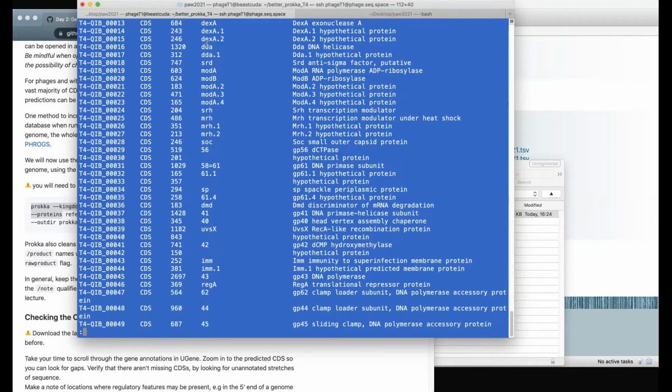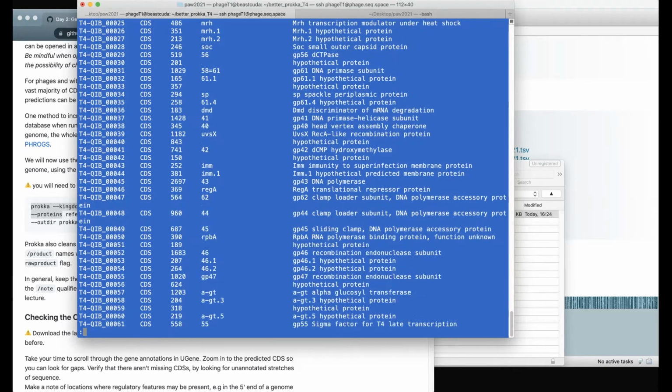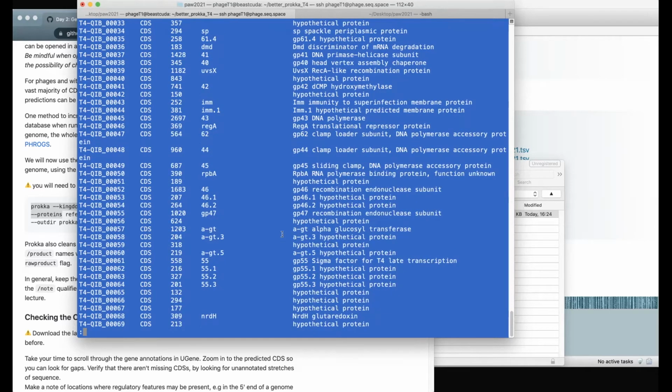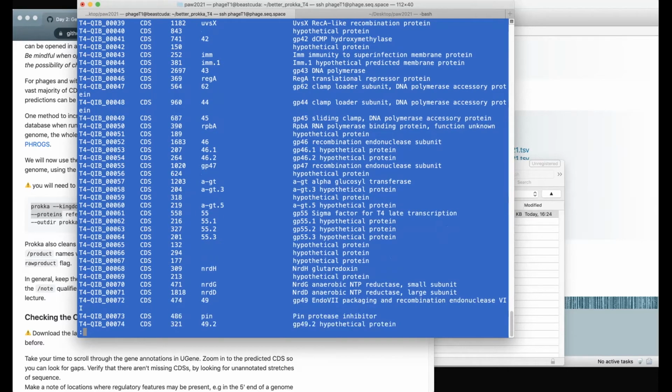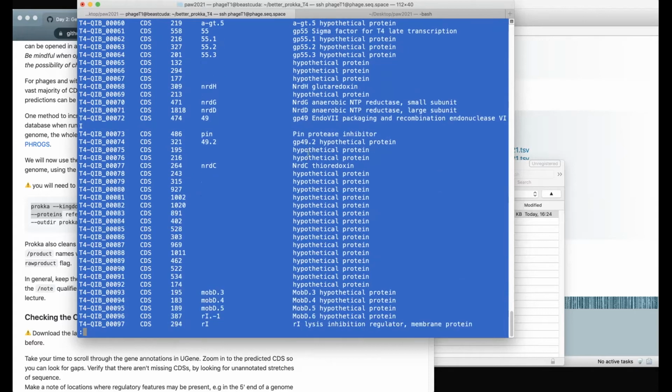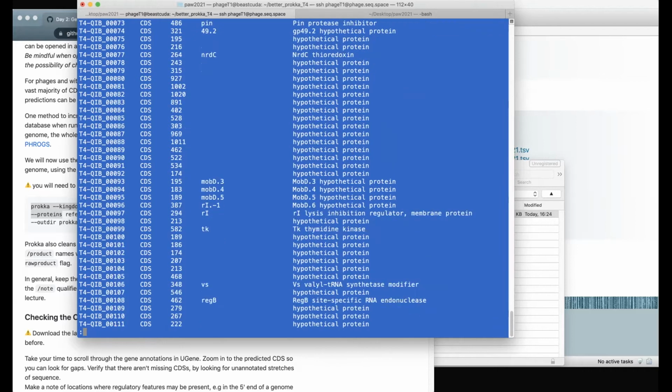In this case, we know that we just have the same protein present as in T4, and it was not greatly annotated in T4 either. And here we see, because we are dealing with T4, and in T4 there are a lot of proteins that have been annotated with the GP function, as Andrew said. So our suggestion would be to move this information about GP to the notes section. So we still have quite some hypothetical proteins, but they're probably also hypothetical proteins in T4.